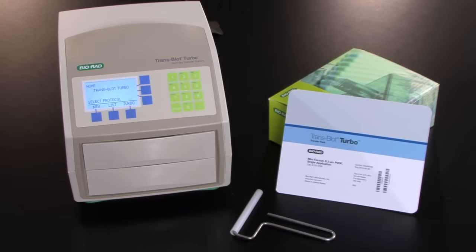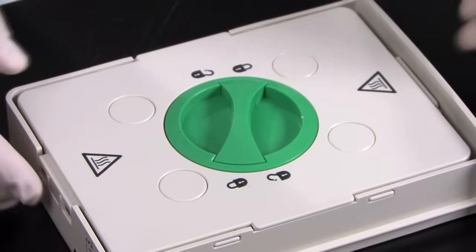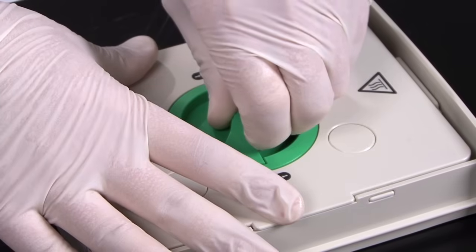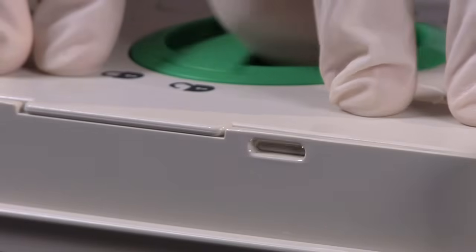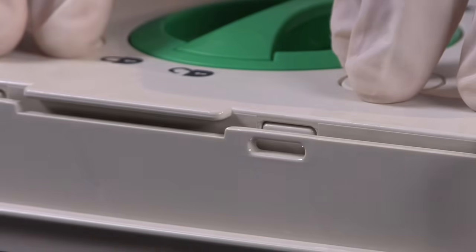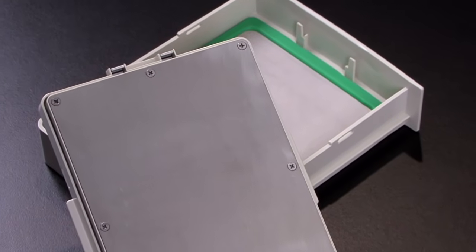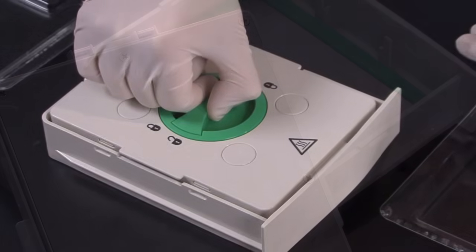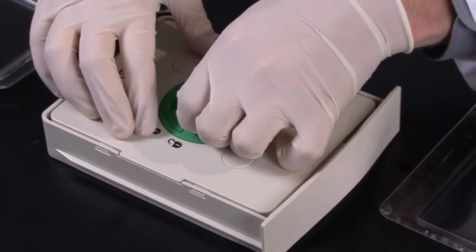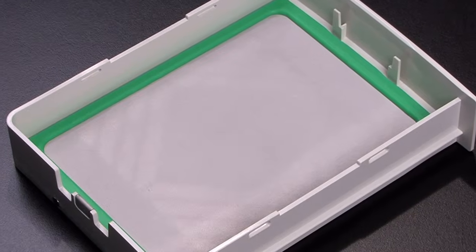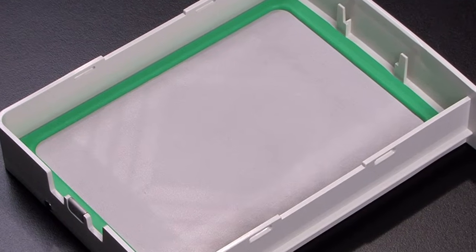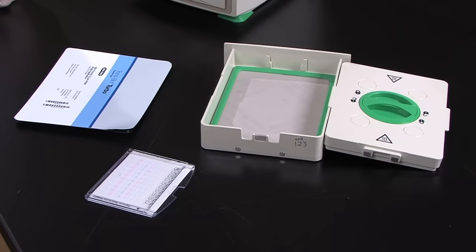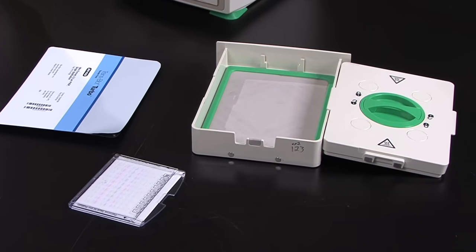First, let's assemble a transfer sandwich using turbo transfer packs. Take a cassette and open the lid by turning the knob counterclockwise. You will feel a small click. The top lid contains a stainless steel cathode fixed to a spring-loaded plate that ensures that equal and consistent pressure is applied to the transfer sandwich. The bottom tub contains an anode plate made of platinum-coated titanium. Both electrodes have been designed to withstand years of use.